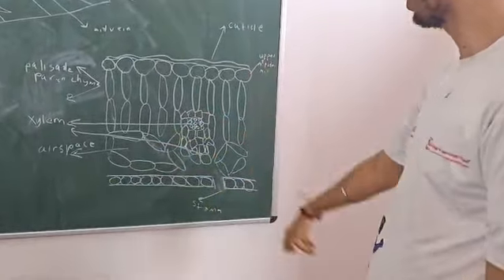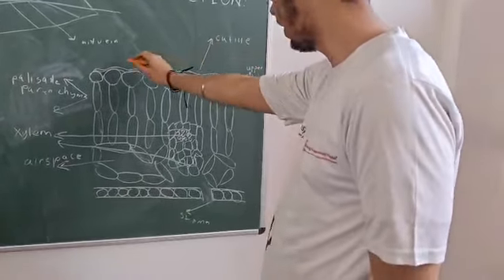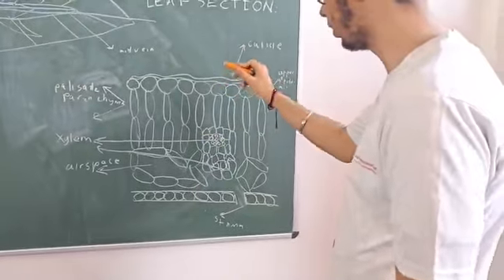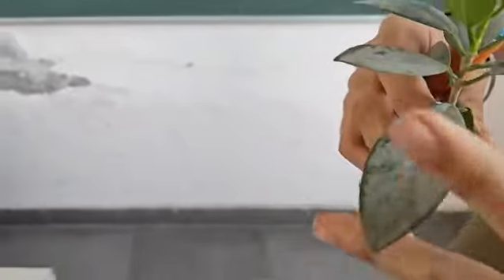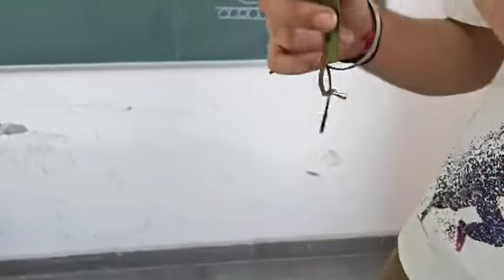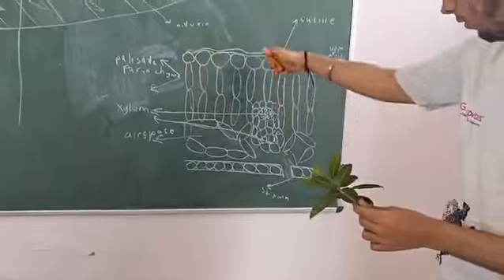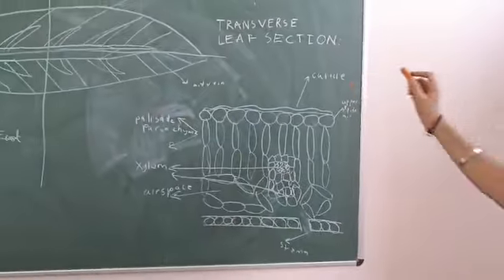So first of all, it's a cuticle, right? So the cuticle's job is basically to act as a barrier, okay? And this is the upper epidermis, because the leaf itself, even though the layer between a leaf, if we cut a piece of this, right, and you see the middle layer, it is so small that you won't imagine. But this is the intricate structure within that part. It's crazy, isn't it? How nature works.